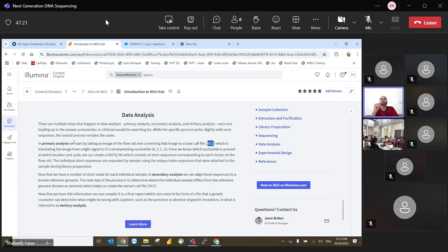One of the experiments that I can do is, if you have any dot in front of you, you can point a finger to that dot and then try to point the finger by closing one of your eyes. Just target any object in front of you, okay, and point a finger towards it, and then close one of your eyes and then change the eye. You will see that the finger that you're pointing actually doesn't point at that particular point if we change the eyes. Same thing happens with multiple camera systems in a machine as well.